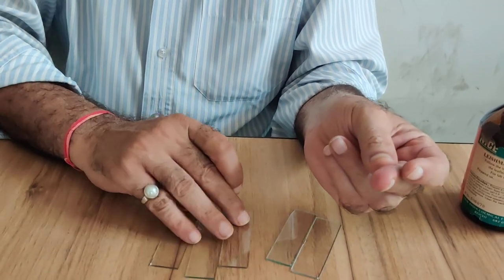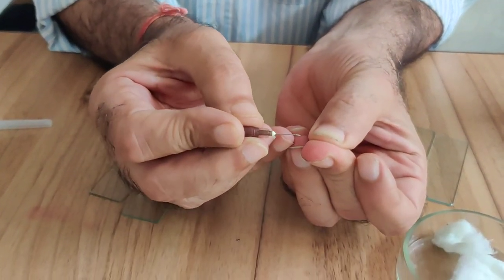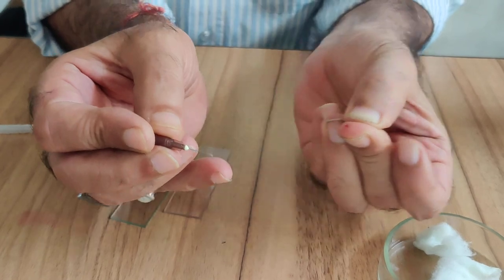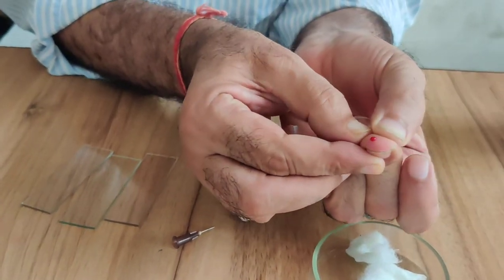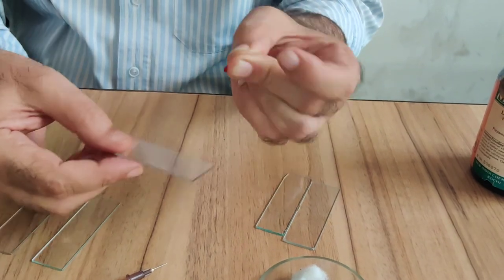Now you have to pierce this needle. Make a pressure here, exert pressure here. Blood will come out. Take this drop of blood on a slide.